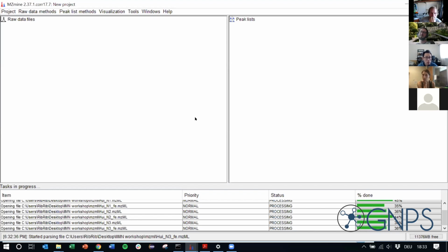In this case, it's a very small data set and the features are fine, so feature finding should work out fine. Maybe this was the reason here. Also, to keep it simple, we decided not to do that.